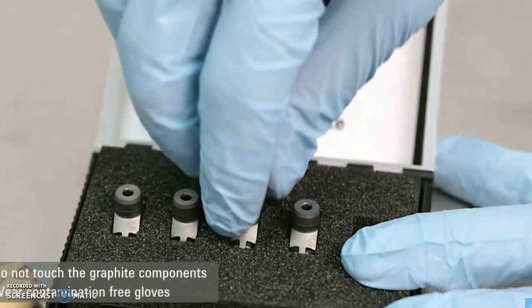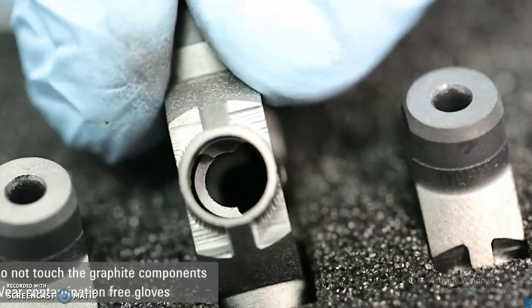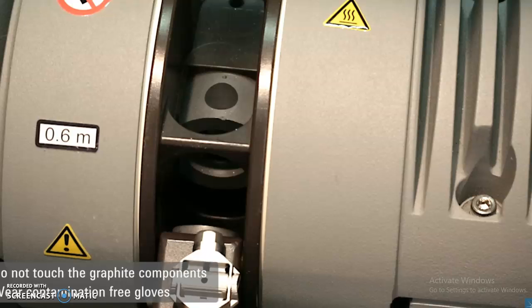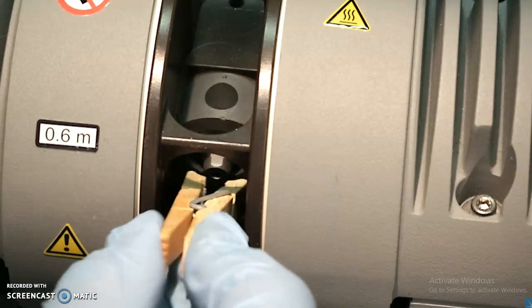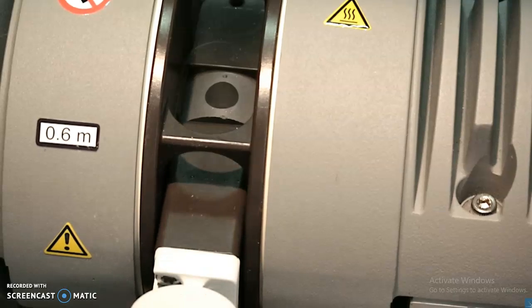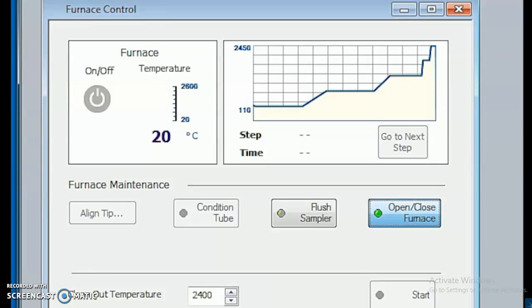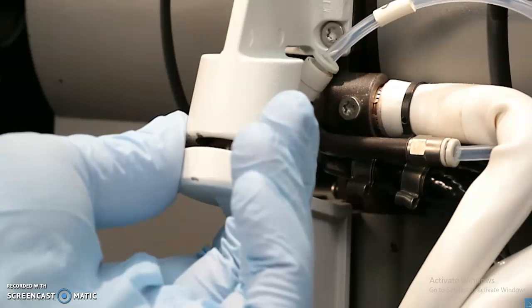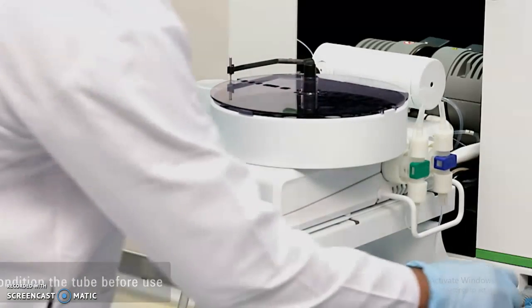The graphite tube is really small. Orient the tube and verify that the side of the tube securing the platform is on the left-hand side of the furnace. Using the insertion removal tool, place the graphite tube to the rear contact. Carefully tilt the front contact housing up into the closed position. Swing the support lever underneath. Click the open-close furnace button in the furnace control window to secure the workhead. Swivel the furnace autosampler back into position and secure.